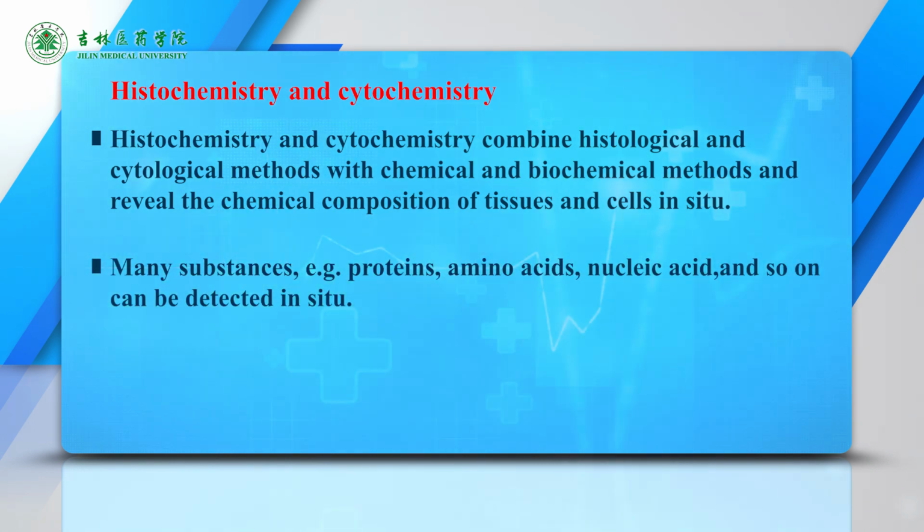Many substances, for example, proteins, amino acids, nucleic acids, lipids, carbohydrates, ions, catecholamines, and enzymes, can be detected in situ by histochemical and cytochemical techniques.